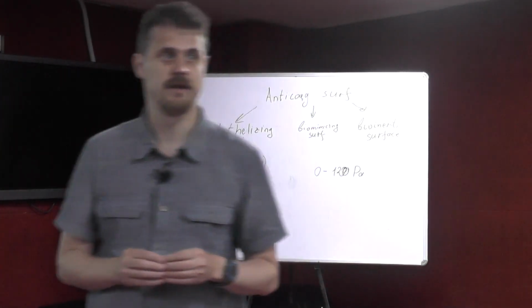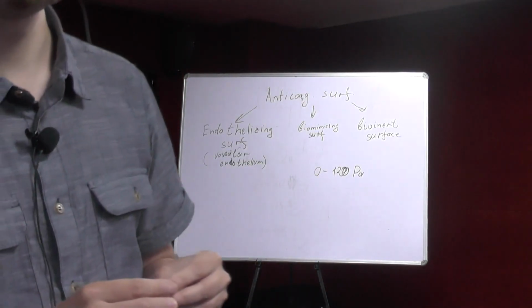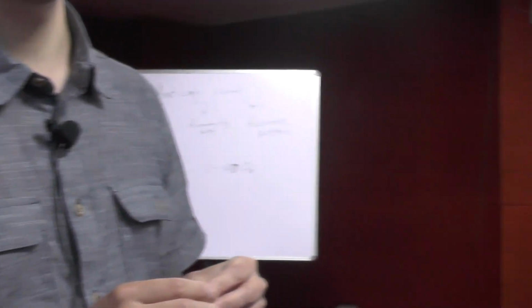Sir, you have mentioned that the microfluidic chips are mostly based on collagen and carbon nanotubes. So what basically is the advantage provided by the collagen? Because I understand it is basically a structural protein. Yeah.